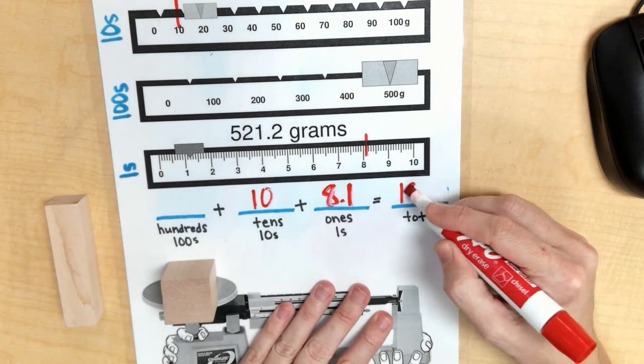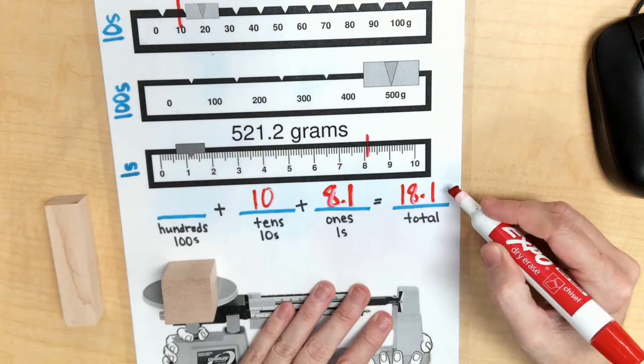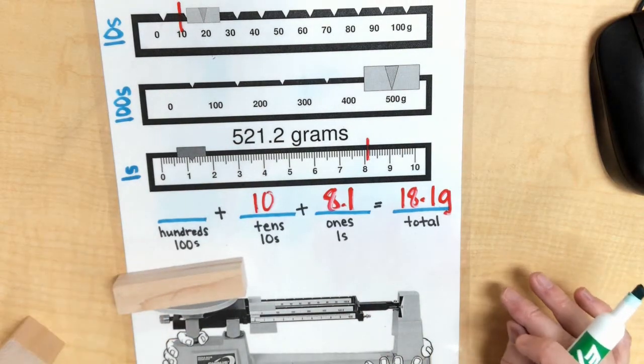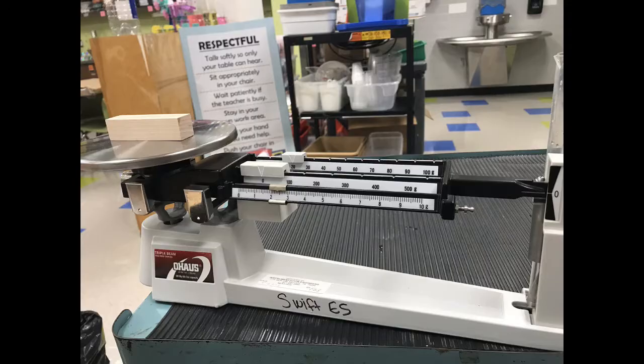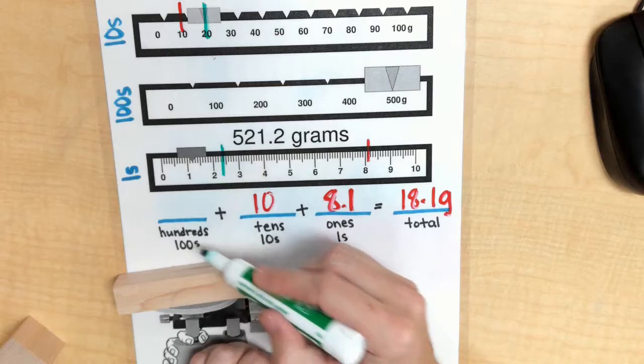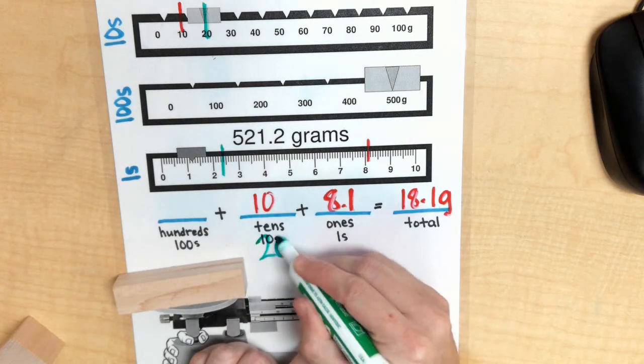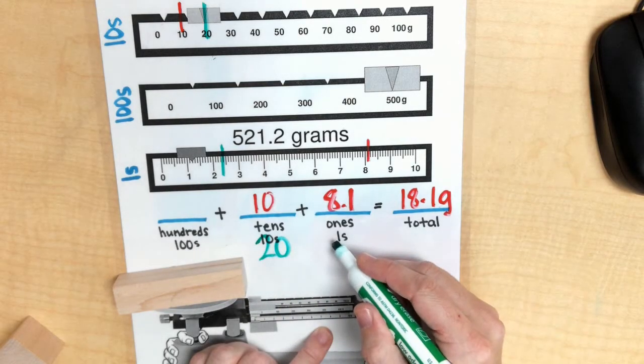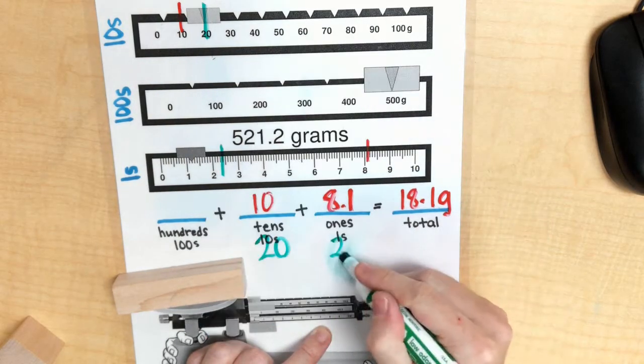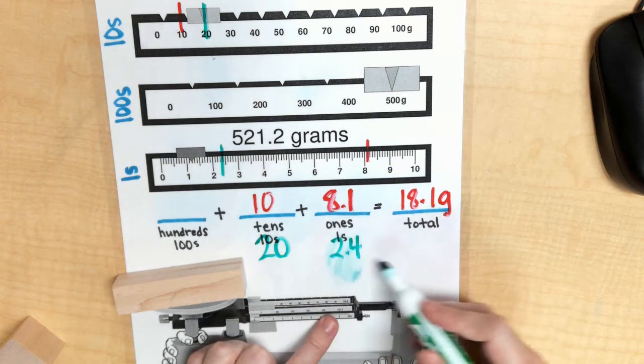Now for my rectangular prism, I placed it on the triple beam balance. And then I read what the measurements were. No hundreds. Twenty. Four. Oops, sorry. Twenty-two point four. Silly Ms. Bell. So that means my total mass was 22 and four tenths grams.